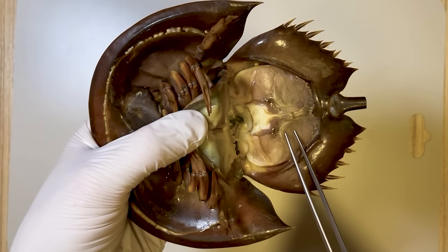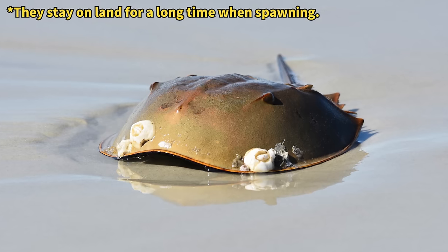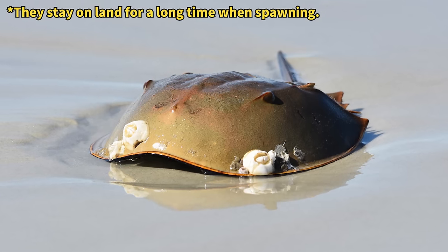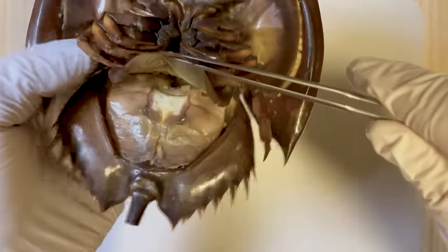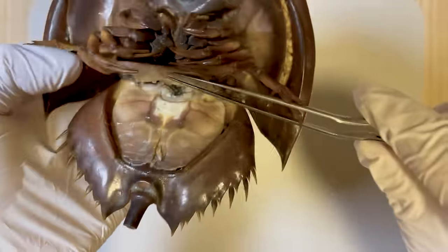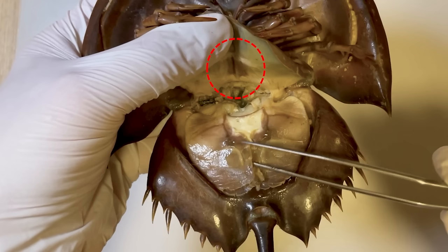These book gills are arranged in a stack resembling a book and function similarly to gills for respiration. If the book gills remain moist, horseshoe crabs can endure extended periods of time outside the water, as they can continue to breathe even in a non-aquatic environment. The uppermost gill resembles a cover for the remaining gills, concealing a reproductive pore beneath. Through this pore, the horseshoe crab expels its reproductive cells.